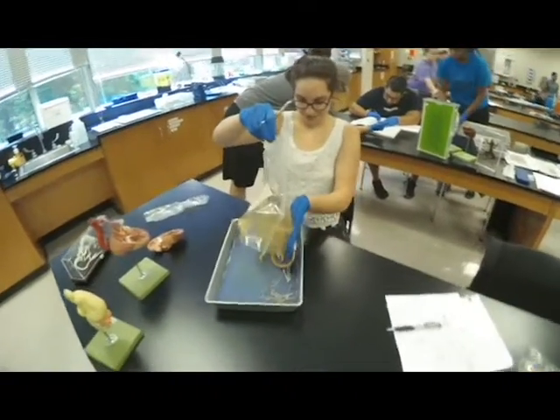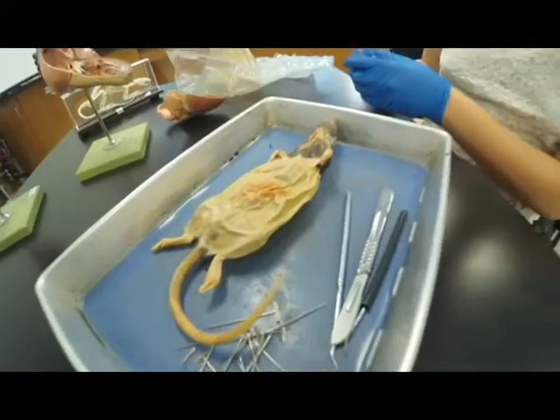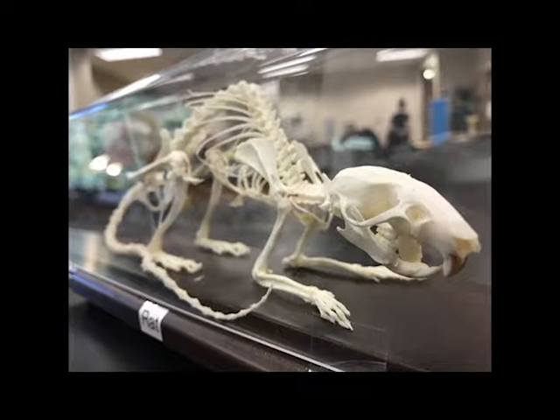Great, so first we're going to look at the rat's integumentary system. This includes its fur, which it uses to stay warm, and we saw some adaptations that mammals first used maybe for when they burrowed. And then we're also looking at the rat's nipples, which are where their mammary glands are located. Then the rat's tail is actually covered by a reptile scale type skin, and that is something unique to rodents, rats especially.